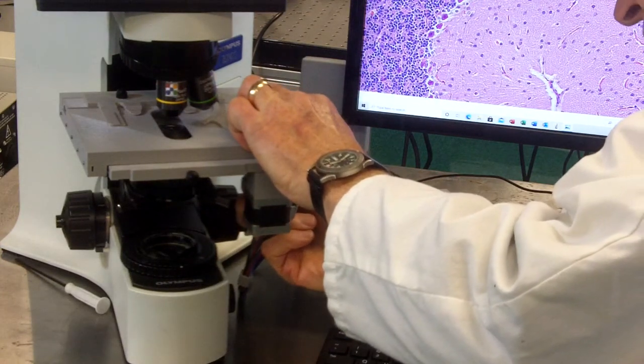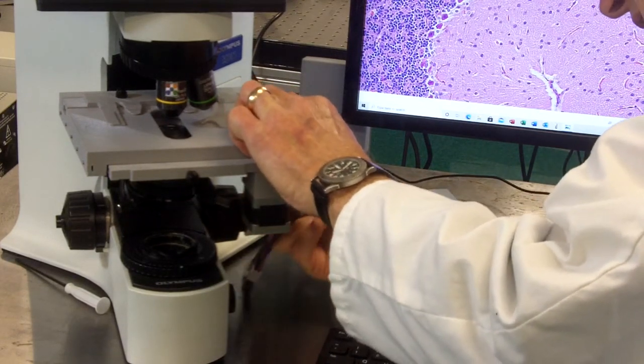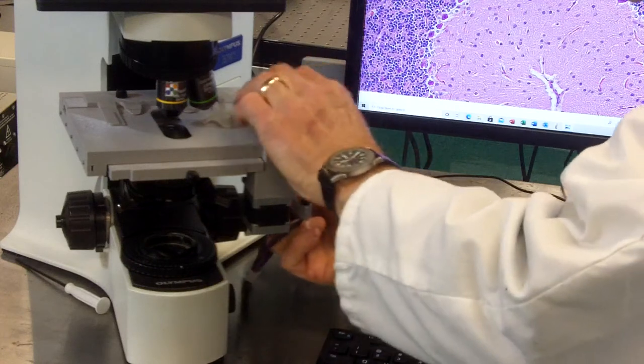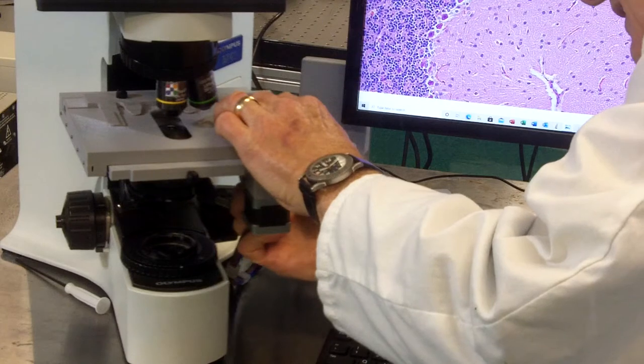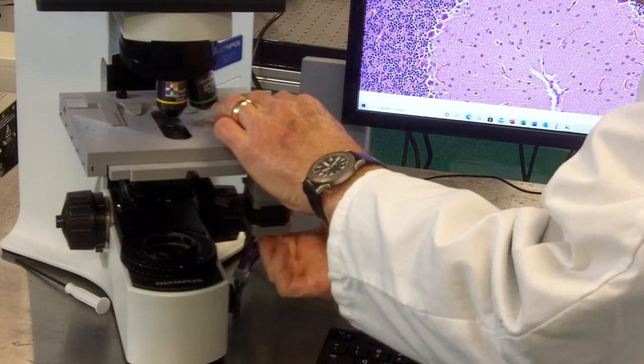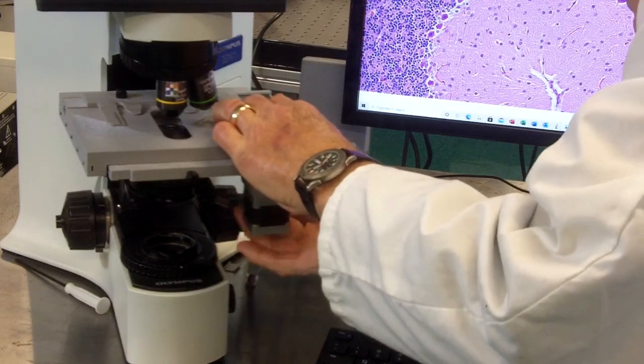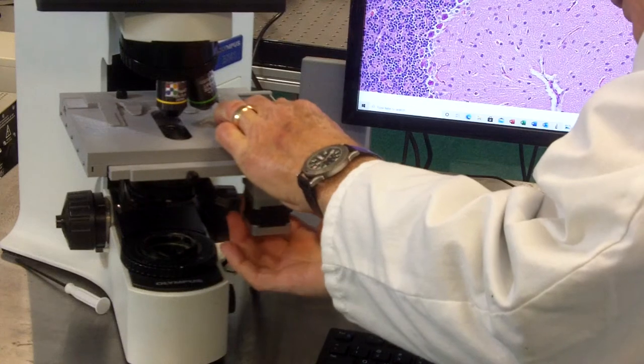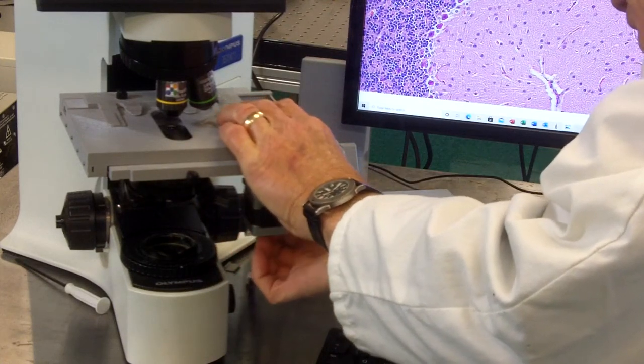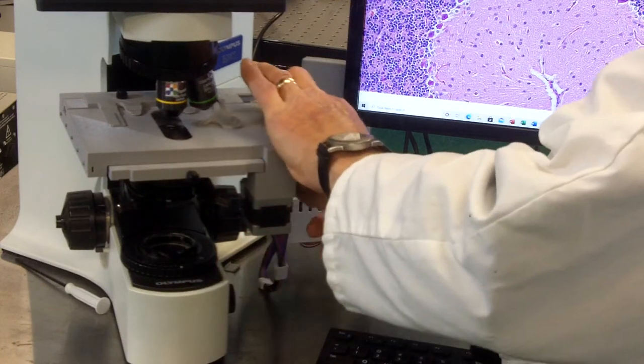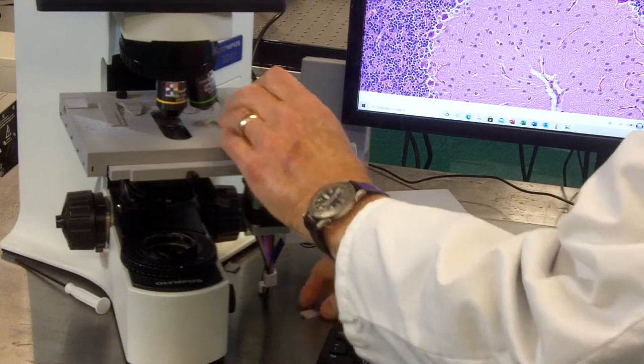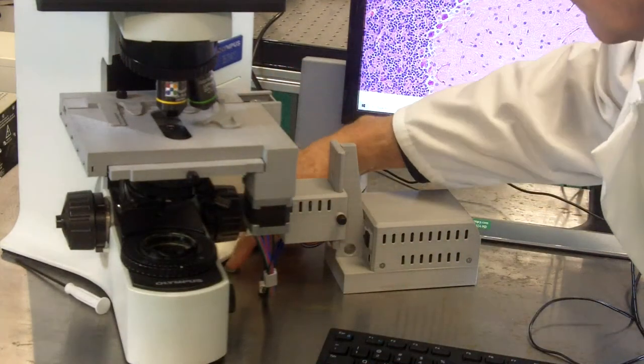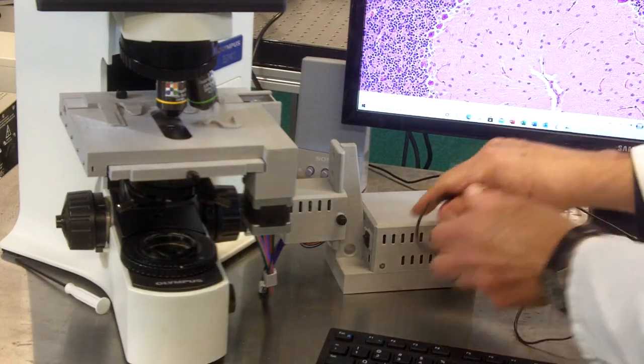One is for the X axis, one is for the Y axis, and the third one is for the limit switches. They only go on one way, so those are clipped on and then we connect the power.